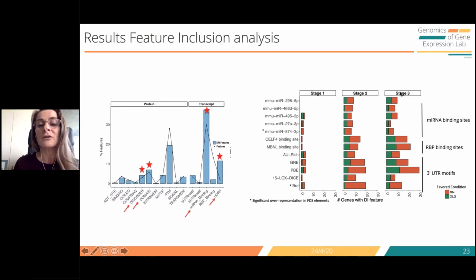This is again the same on a time course analysis, but basically the same idea. We can evaluate different microRNAs. So this is more on a full category basis, but this is now for particular functional elements separately. And then we can see that in these cases, we have microRNA binding sites, RNA binding protein binding sites that change their inclusion in a significant way in some cases, and some other motifs of UTRs between one condition and another, and then start making hypotheses on these functional changes.